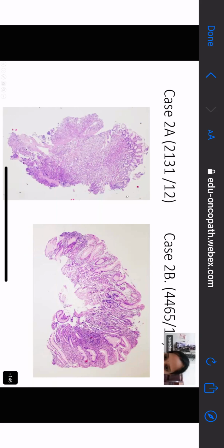But you never said to me whether you think that there is, what is this left side thing, from where has this gastric biopsy been taken? It is taken from the antrum or the cardiac portion, ma'am. This biopsy over here is taken from the fundus, ma'am. So what is the meaning of the fundus? What kind of mucosa is this? Fundus, what does the fundus have? Is it cardia type? Is it antral type? Is it body type? What is it? Body type, ma'am. So why did you say antral? How do you know it's body type mucosa?